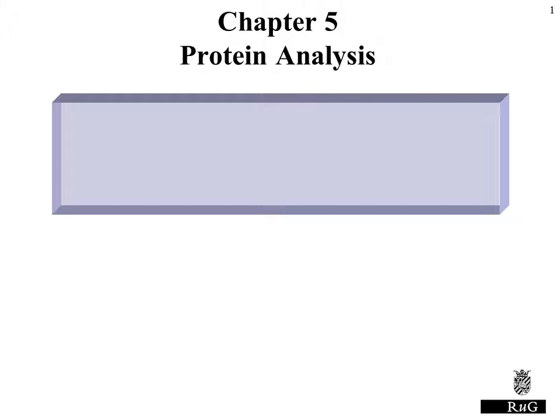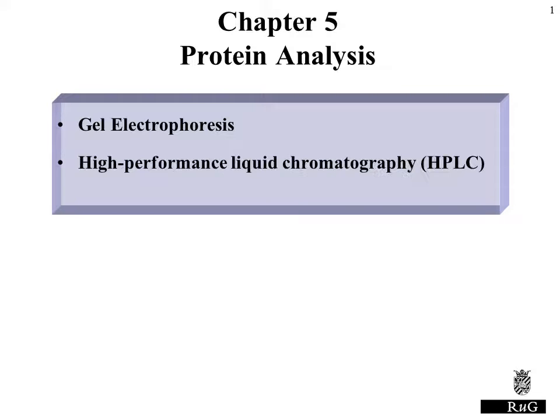Chapter 5 will deal with the analysis of proteins. There are two major techniques to separate proteins. One is gel electrophoresis and the other one is high-performance liquid chromatography, which you've already heard about.